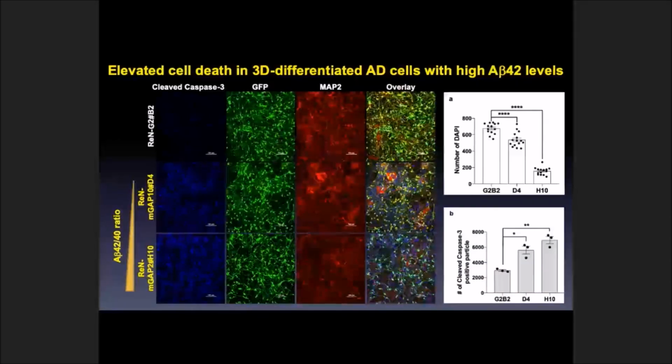One caveat is that this is interesting, because when you look more closely at which cells express caspase and which cells show cell death, we found that the majority of active caspase cells here and here are non-neurons. Most of them are astrocytes. So the idea we had before was that generally we have tangles and neurons going down with caspase-3 activation. That's a simple idea. It doesn't seem to be the case. So we are very interested in the role of astrocytes in these neuronal deaths.